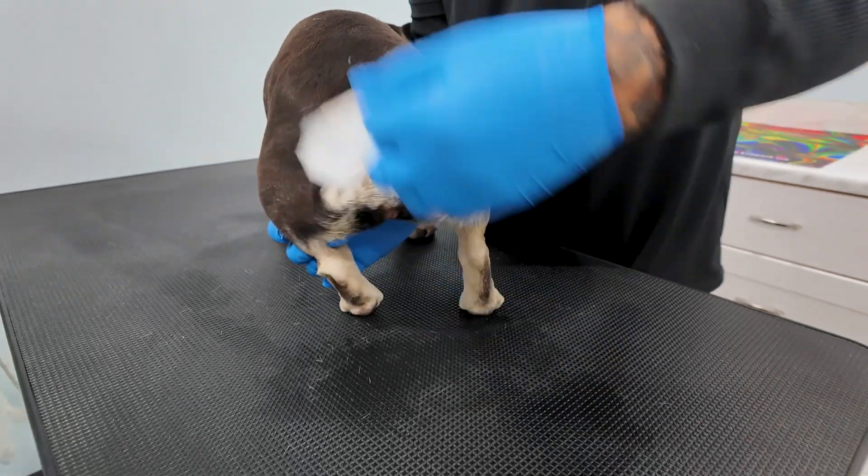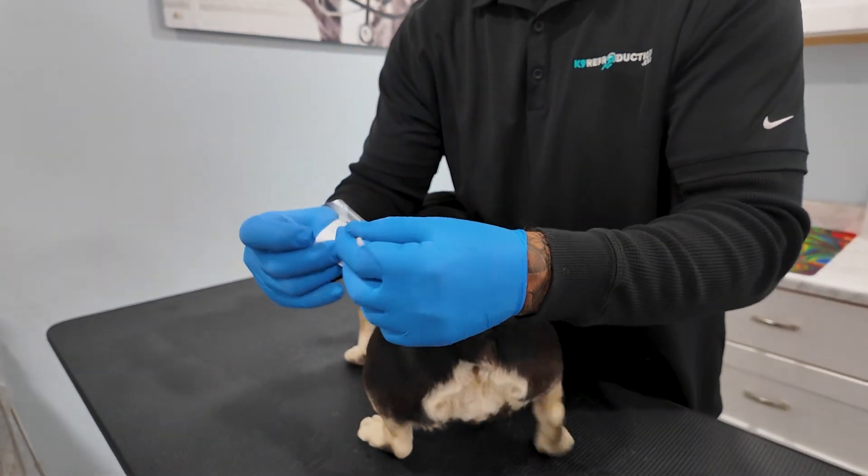After that, I carefully place the swab back into the sterile wrapper to keep everything clean and uncontaminated.